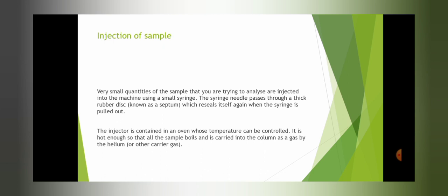Splitless injection is used for trace analysis, to analyze dilute compounds. So the difference is that for split injection, the sample is concentrated, and for splitless injection, the sample is diluted.